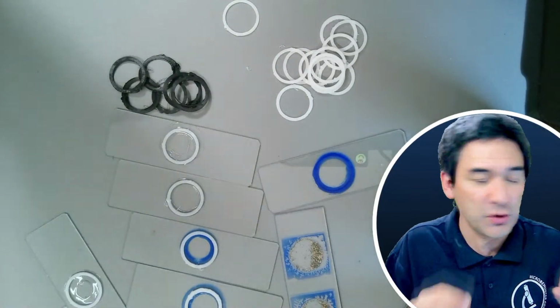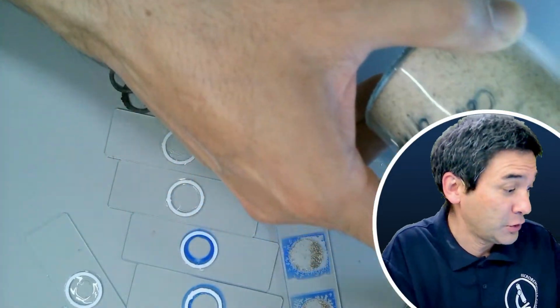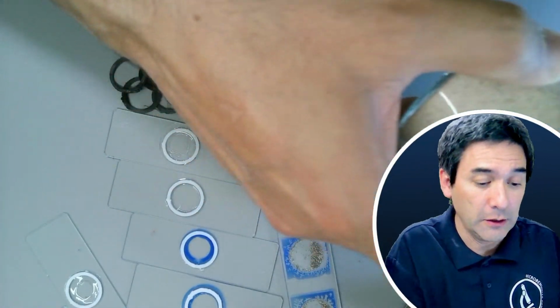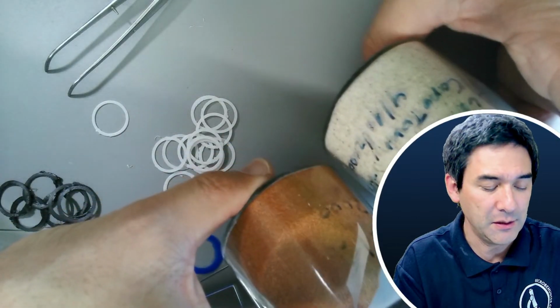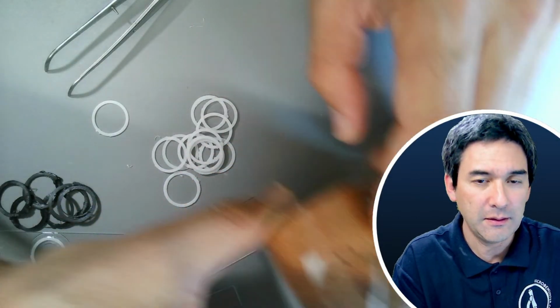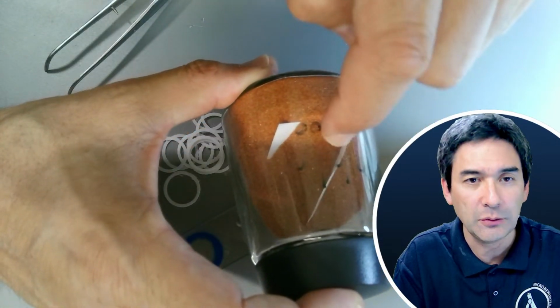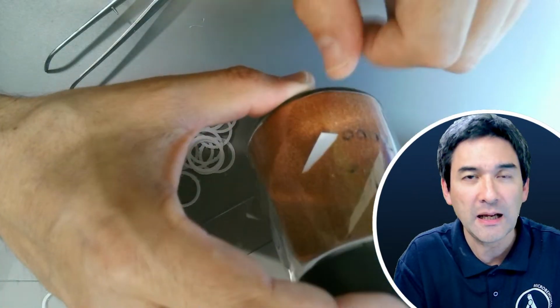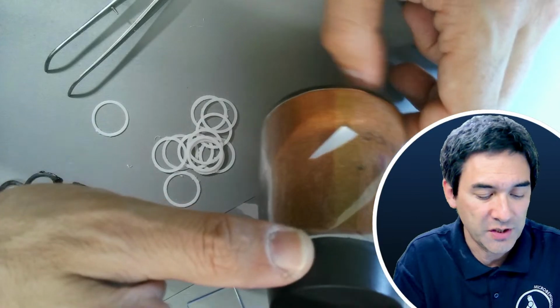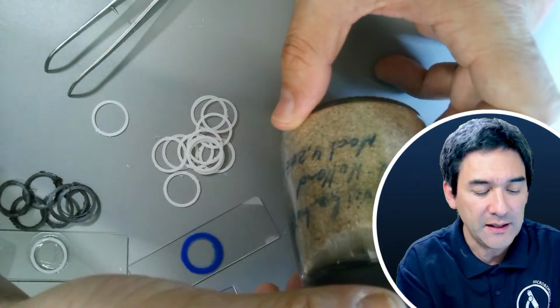Okay, so a little bit some background information here. I've got here, and I'm just going to show this to you. Here, actually in my cellar I have even more. I've got a lot of sand. Okay, I have to shift this around here a little bit. A lot of sand samples here. I labeled the jar itself, and you can see that the paint came off. Luckily I always included also a little piece of paper with a description. So this one over here, for example, is from the Kalahari Desert, which a student took along. This one here is from the Netherlands.